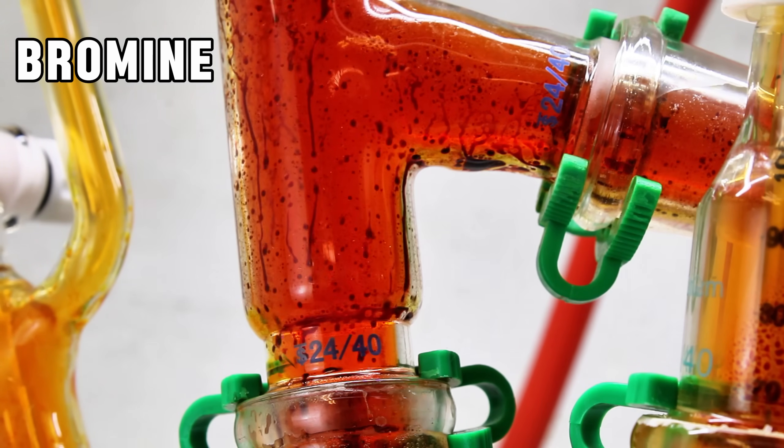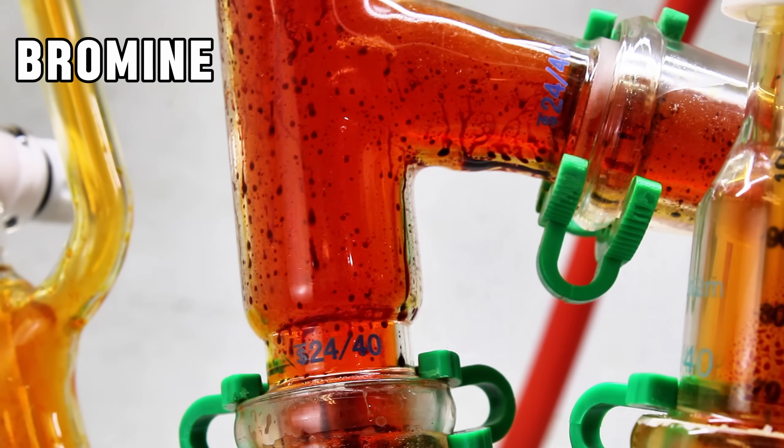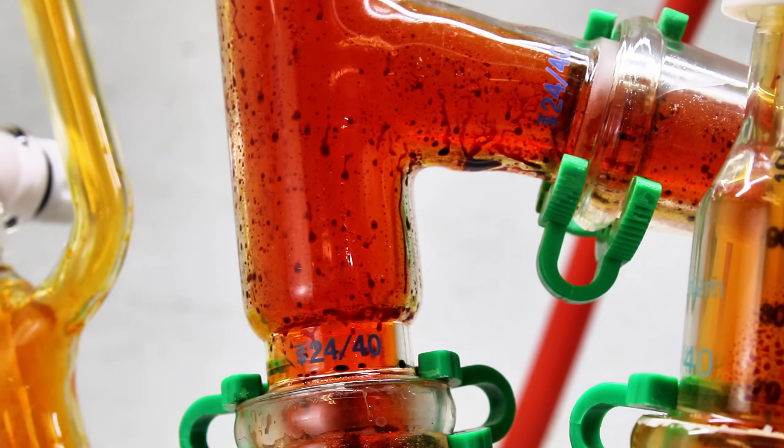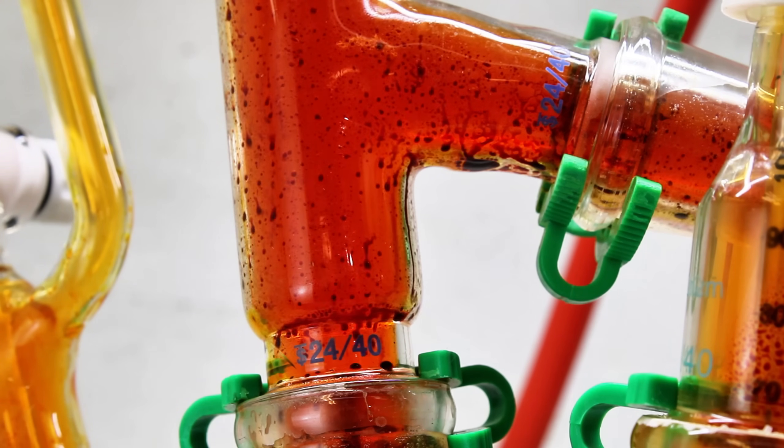Today I thought it would be fun to make up a batch of my second favorite element, bromine. I've done this once before on this channel, but I like this method much more, and I'll get into why later on.